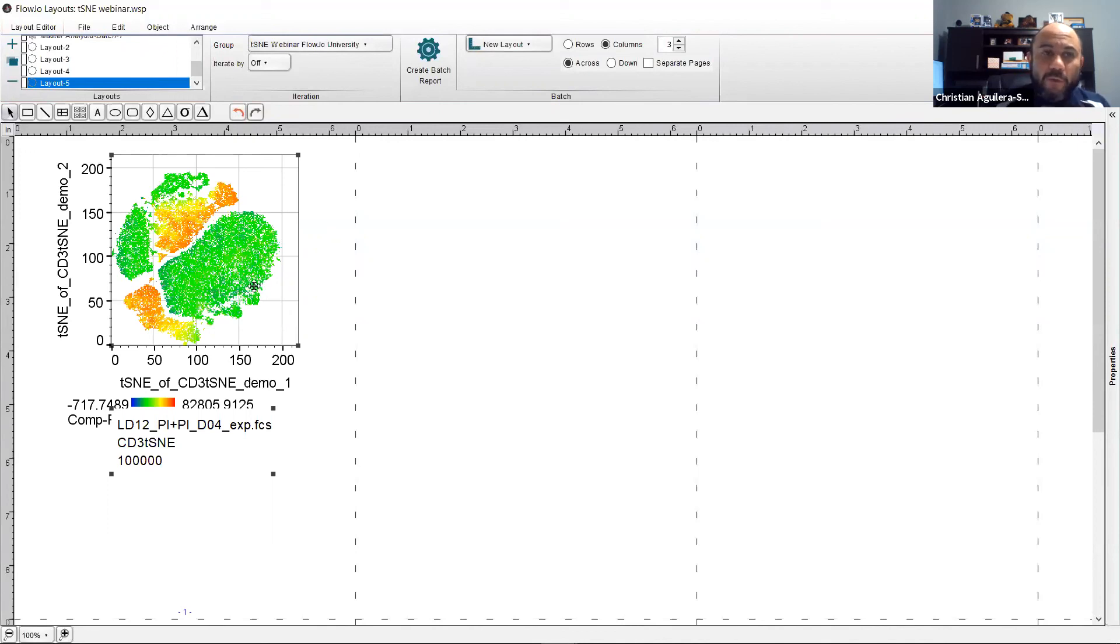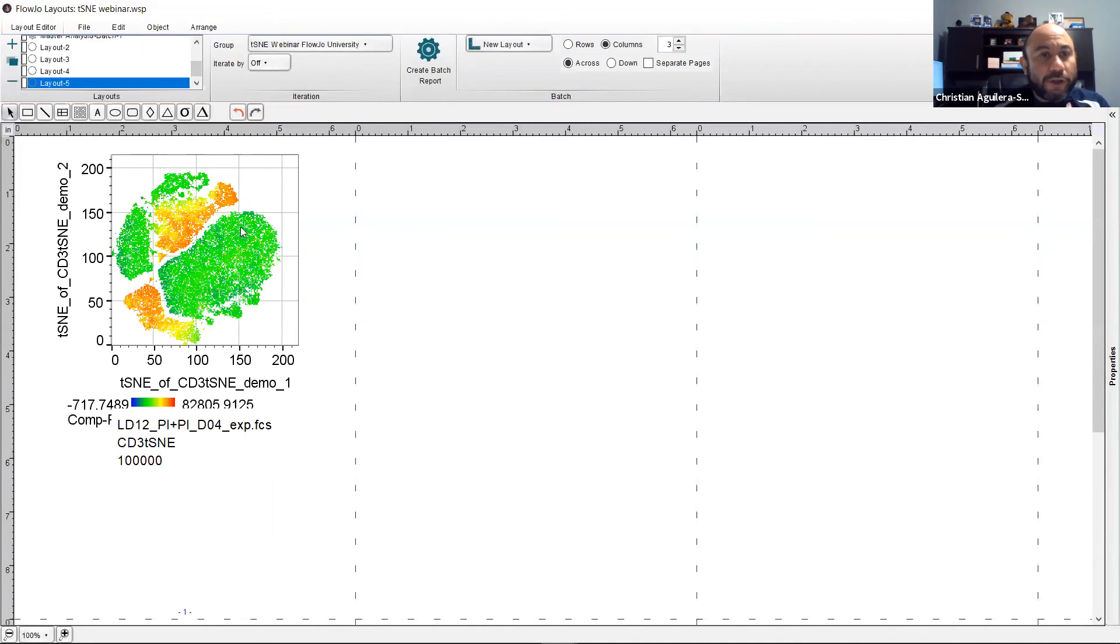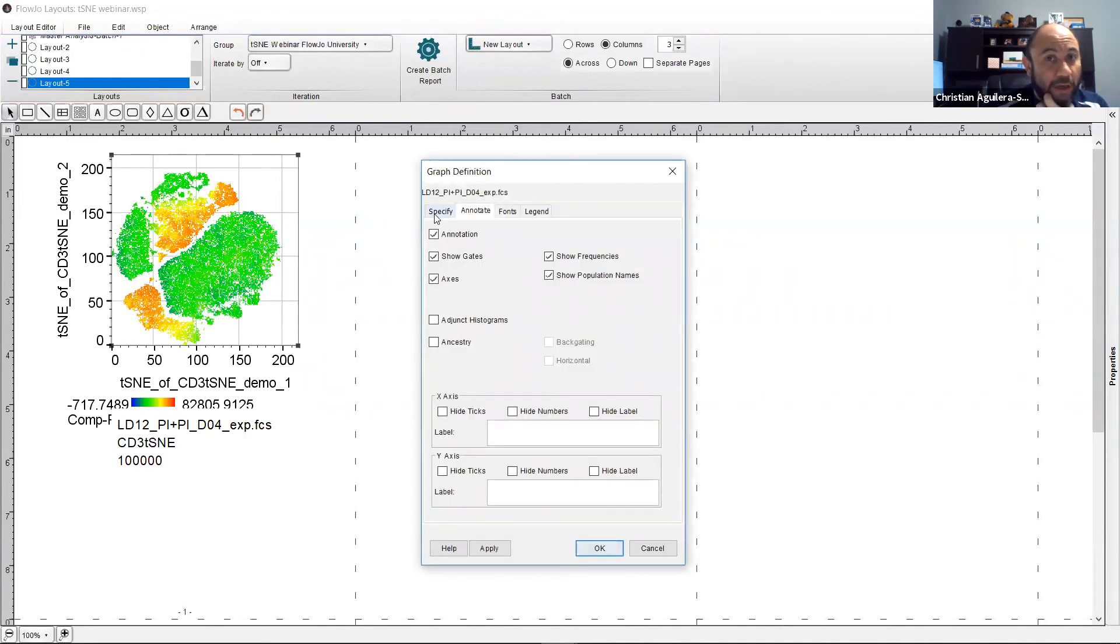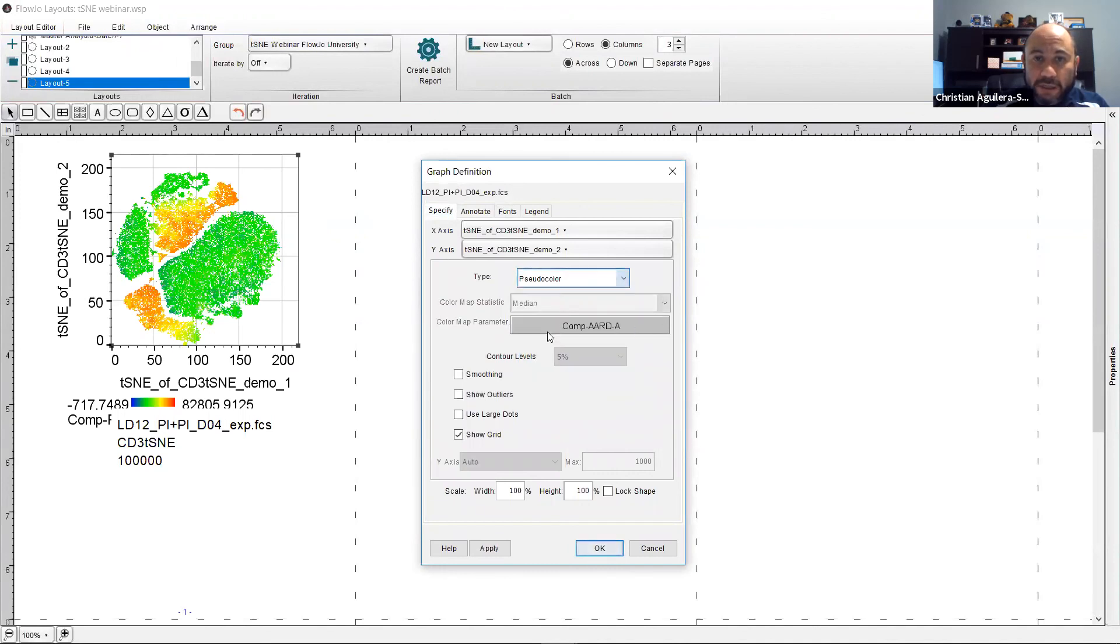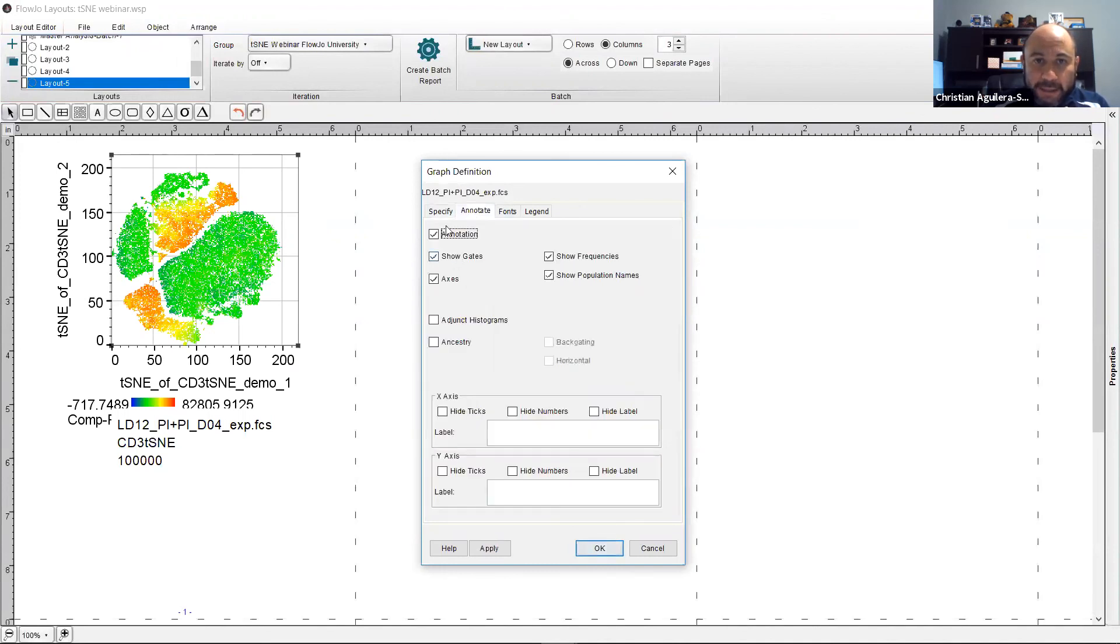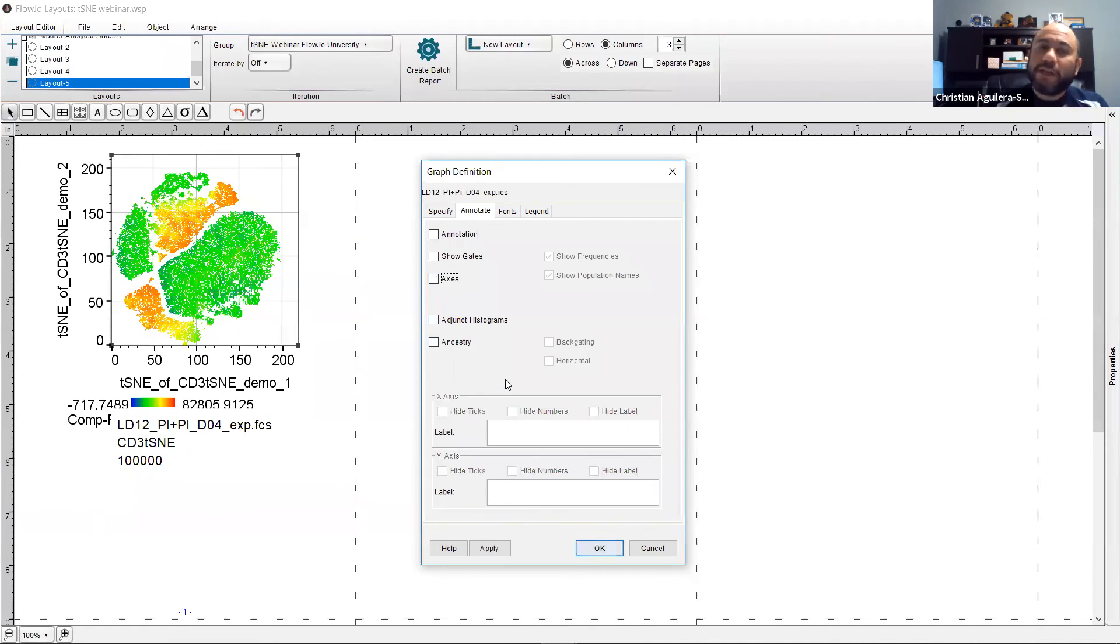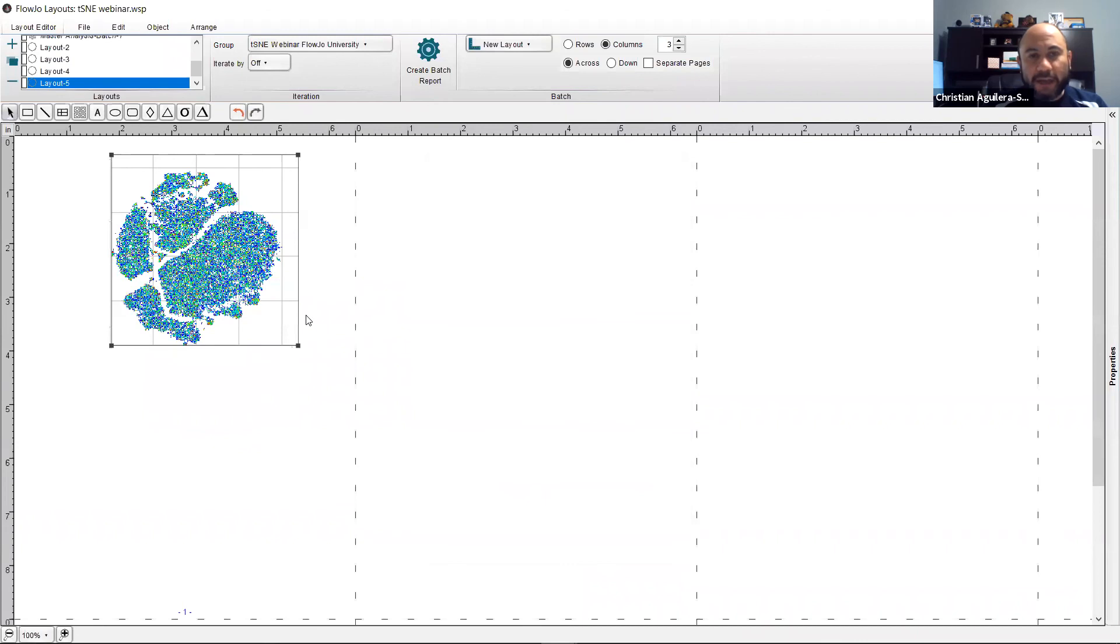However, what about if we want to choose the visualization and remove the axis? Well, you simply double click the dialog box. On specify, we're going to select pseudo color and on adaptations we'll go ahead and remove all of the axis labels since we are working in the high dimensionality space. We press okay and there you go.